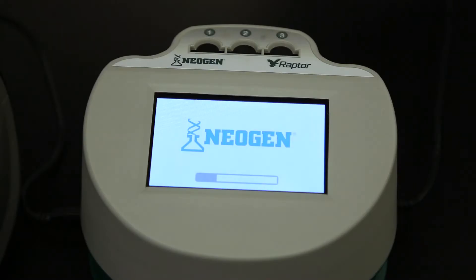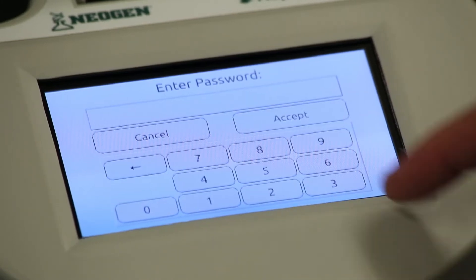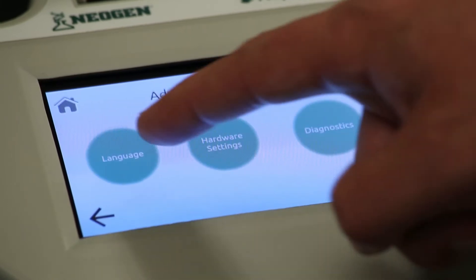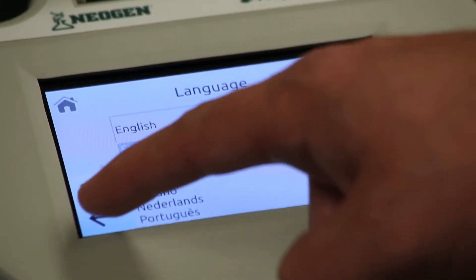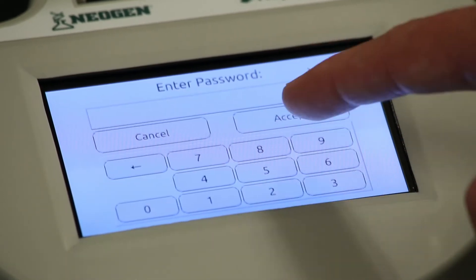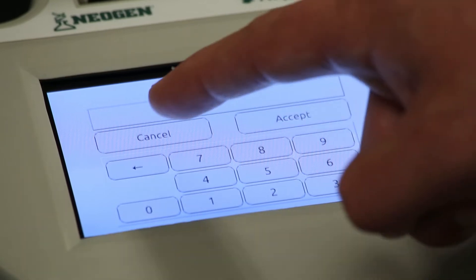For every power cycle, the Raptor performs a camera resolution and LED check and notifies the user if there are any issues. The advanced settings are password protected for quality managers to access. Here you can choose the language displayed on the Raptor screen. Hardware settings are further password protected and reserved for Neogen technical support only.